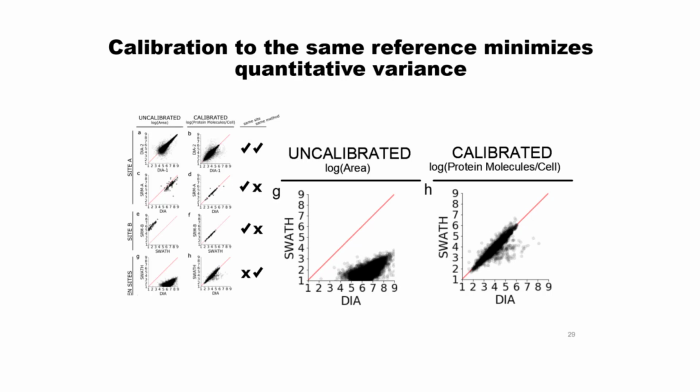And then we went the last little step, and that is if you take the QTOF data from the Aebersold lab and you take our quadrupole Orbitrap data, the Q-Exactive data, they're really not correlated or calibrated very well. But when you calibrate them to a common reference material, they actually are very easy to compare between the two different labs. This data was reported in 2015. This was collected in 2017, reported in 2018. You know, this is three years apart from one another, different countries, prepped by different people, measured on different instrument platforms, but yet at the same time you can get the same results between different labs if you use a common reference.